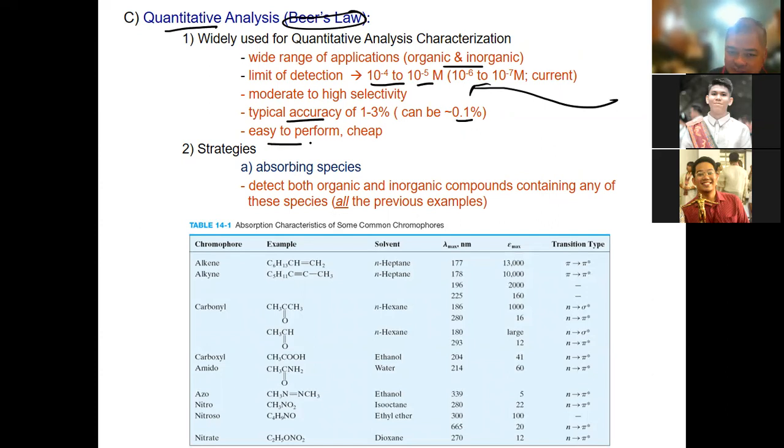And this is the most important one. It's easy to perform and it's a little bit cheap. Spectronic 20 can do everything. I think after the balance, this is the most important instrument that you need in the lab. Okay, and you can do a lot of analysis.